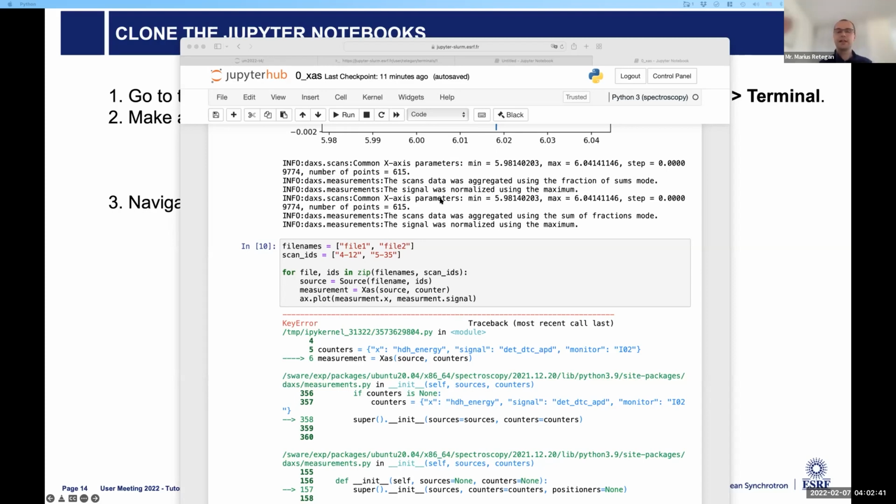Yes, but okay, this type of programs, like this type of libraries, can be used everywhere as long as the data has the proper format. So I do not know what exactly is used at Hamburg, for example. If they are still using spec files or it's switched to ASCII files, similar to spec.